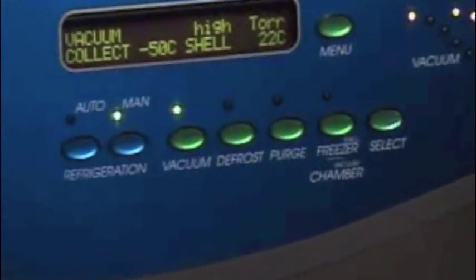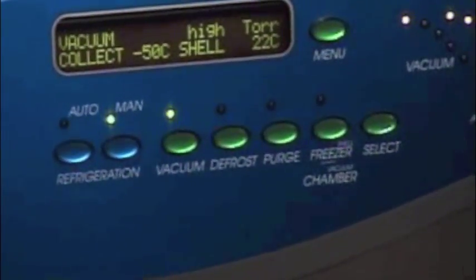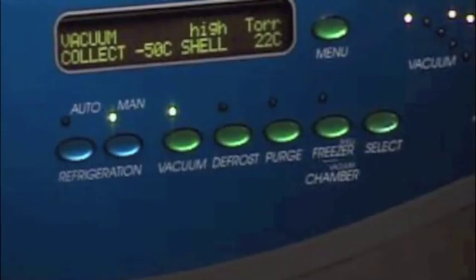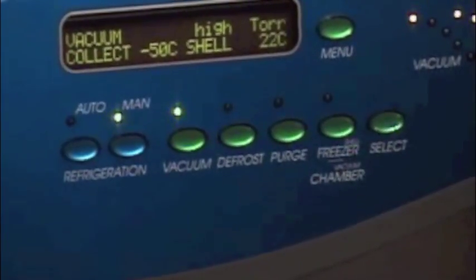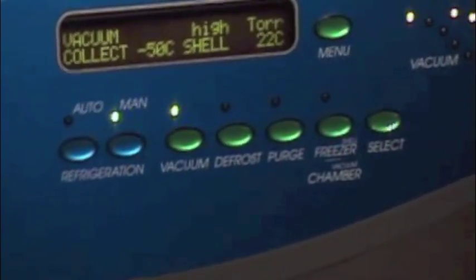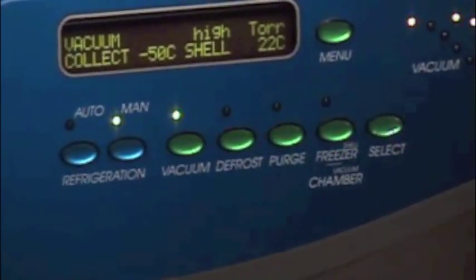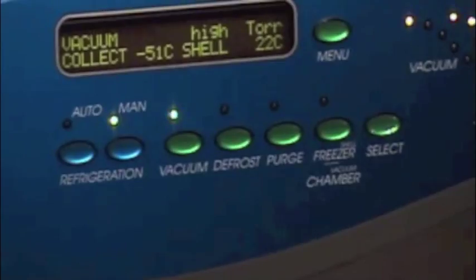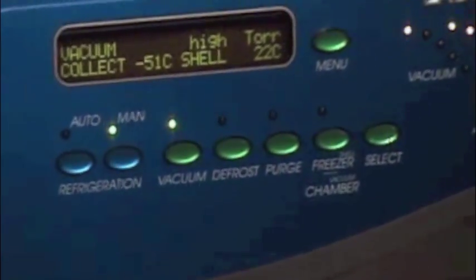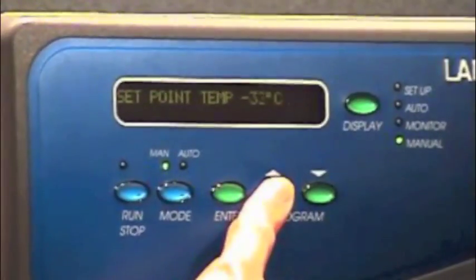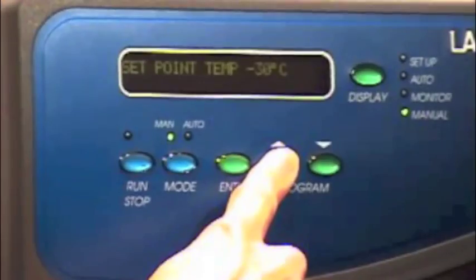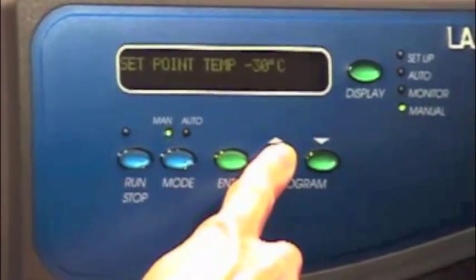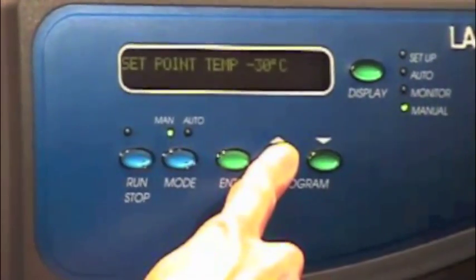After pre-freezing, allow the collector coils to reach at least minus forty. Press the vacuum button to start primary drying. When primary drying is complete, increase shelf temperature for secondary drying.